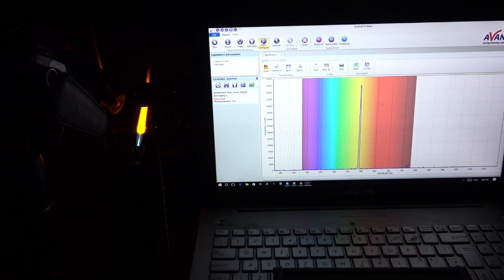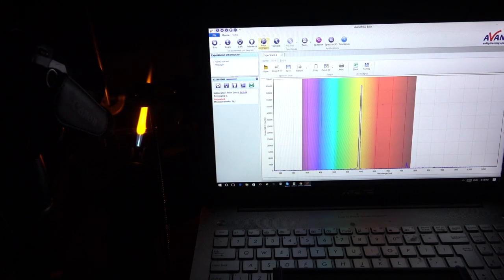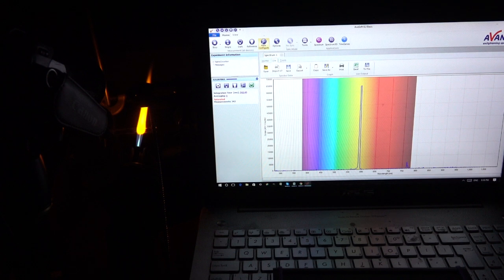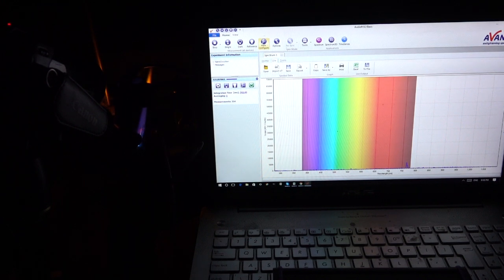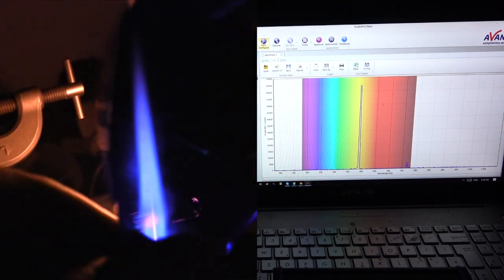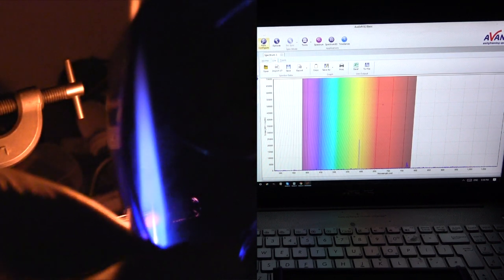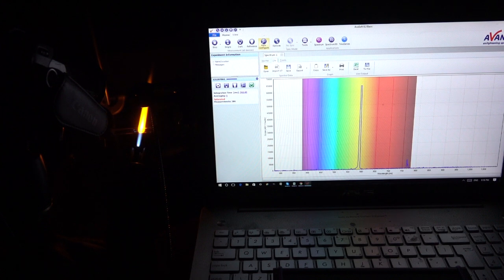And this can actually be a real problem for glassblowing. Not just in that it stops you from seeing what the hell is going on, but if you do this with a big piece of glass, you can actually damage your eyes. There's so much light coming off on this yellow excitation line. And that's why these are not only necessary for safety, they're necessary for you to see what the hell you're doing. So if I actually get my glasses here and just put them into the flame like that, you see it absolutely kills the orange color. And you can see what you're doing. And this line here just vanishes almost completely when you put the glassblowing specs in there.